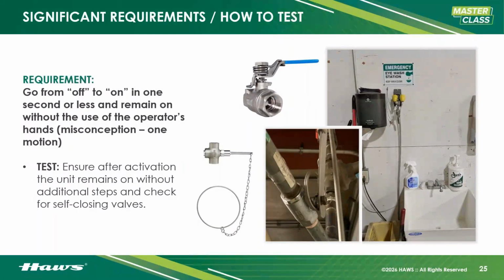But watch out for situations where you have to manually activate and hold the device. You need your hands for other things. You want to be able to peel those eyelids back and things of that nature.